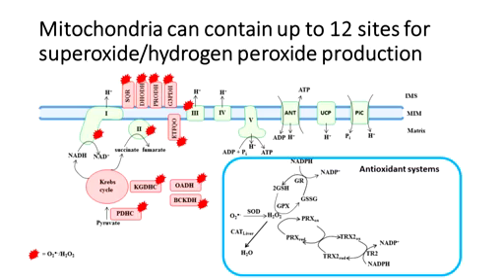The simultaneous measure of both ROS and NADH production also allows for a direct comparison of the superoxide hydrogen peroxide forming potential and activity of individual enzymes, which can be valuable for screening inhibitors for ROS production prior to conducting assays with mitochondria.